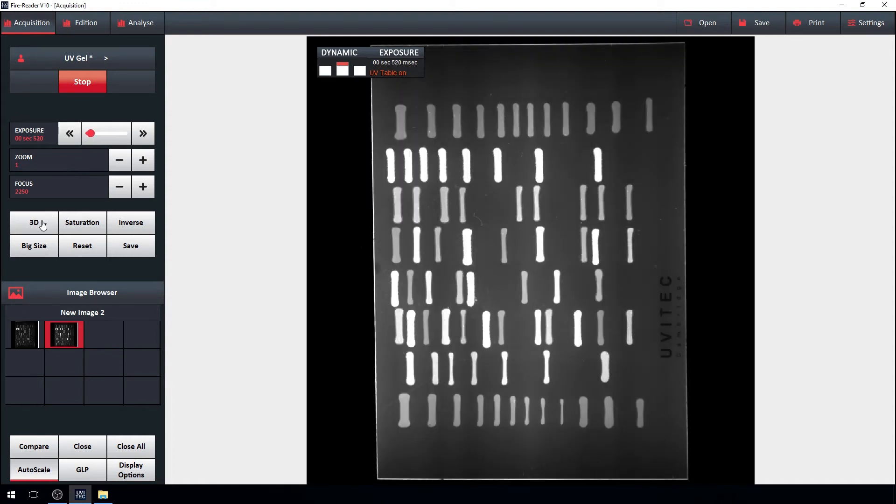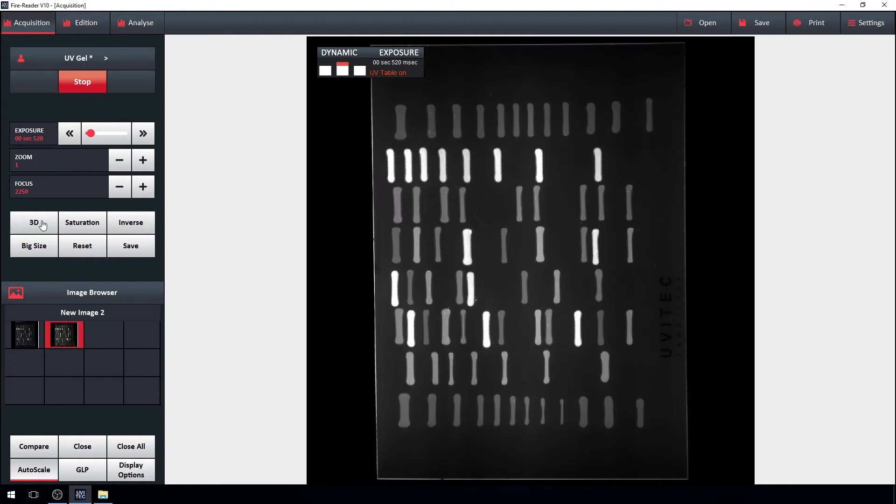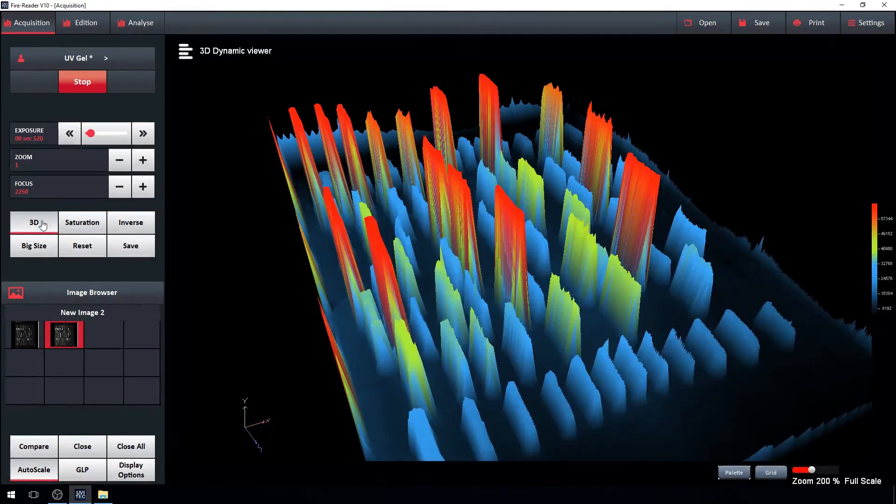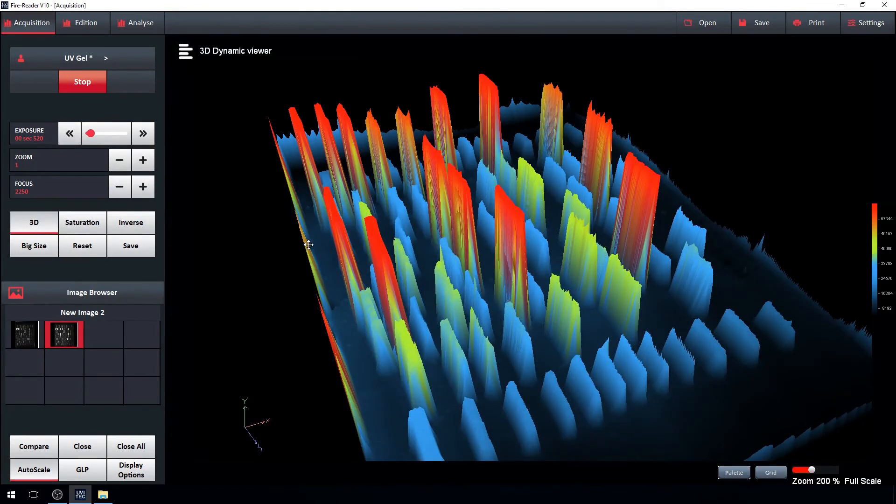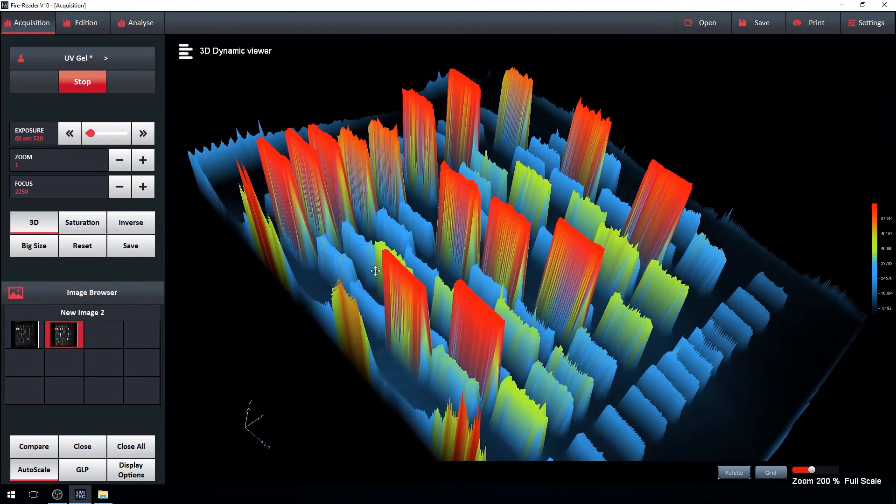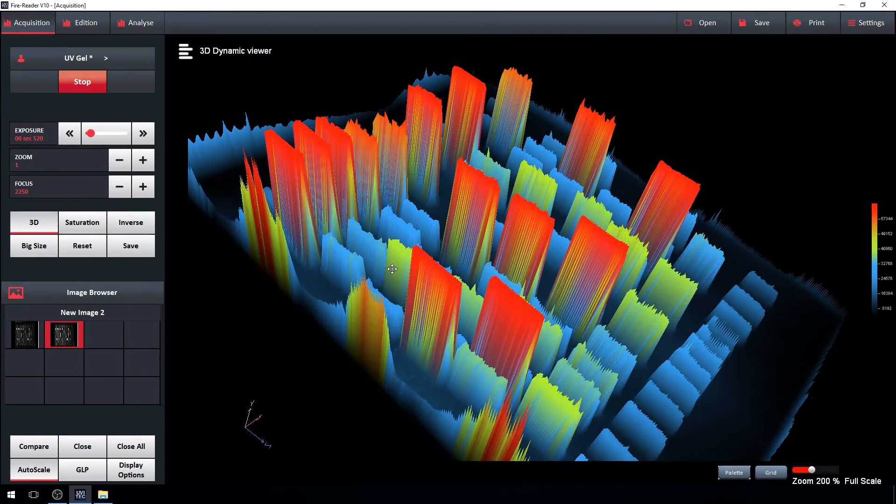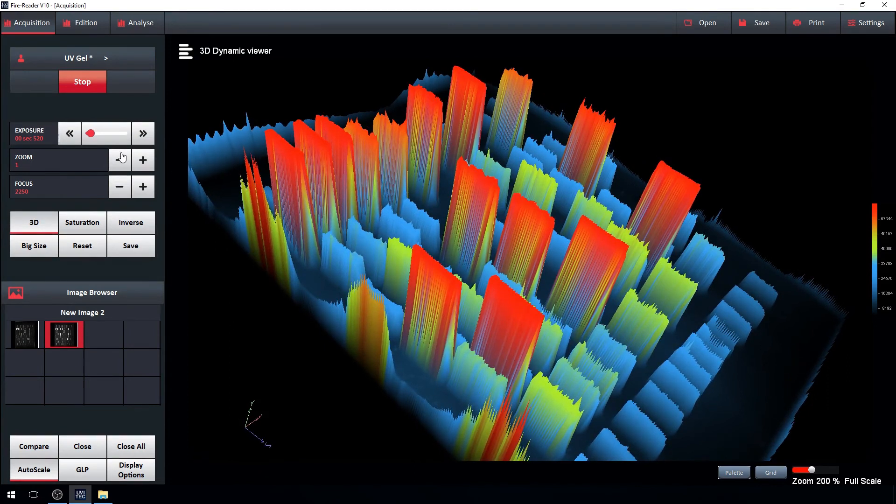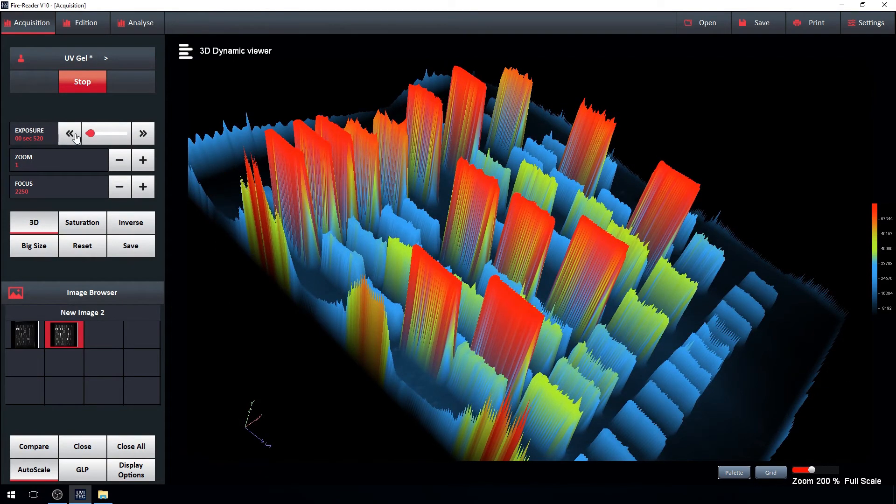And there's more. The live image can also be viewed in 3D, a beautiful way to better distinguish a band saturation to another.